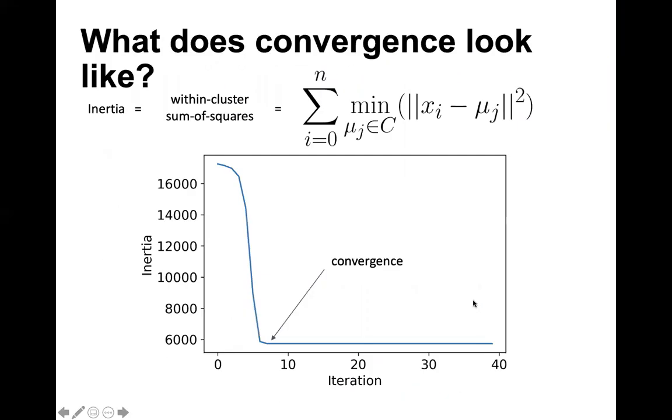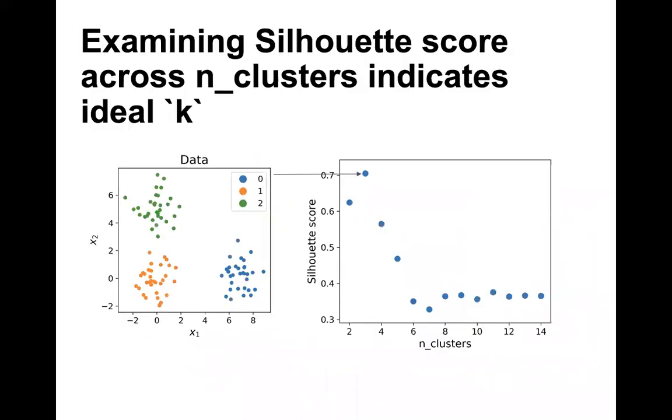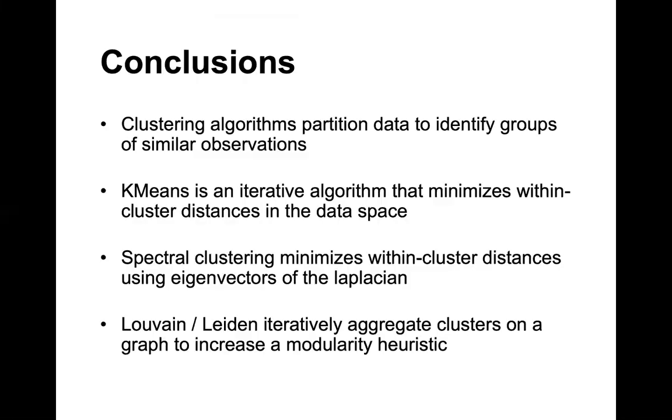One thing that I would say is that, from my experience, clustering is a lot more subjective than most biologists attribute to it. Most biologists seem to have an idea that there are these cell types out there and we simply have to discover them using the right algorithm. That's not true at all. Cells don't maybe naturally exist in types. It's a construct we're putting onto the cells, and so it's an extremely subjective method.